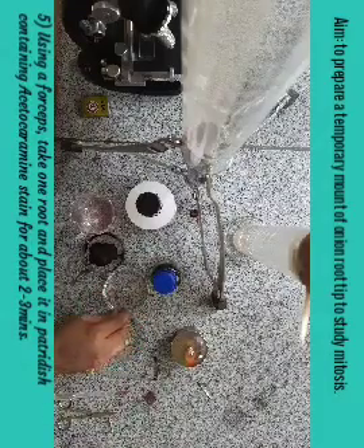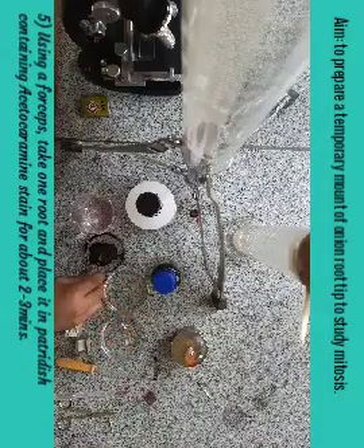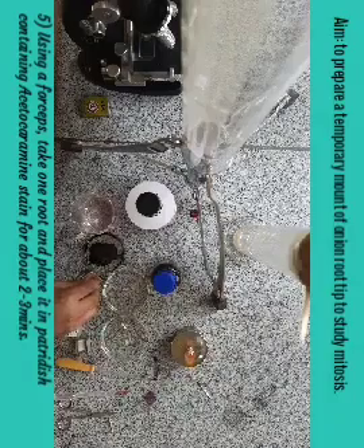After heating, take the root tips with the help of forceps and transfer them into another petri dish containing the carmine dye, and keep them in this carmine dye for about three minutes.